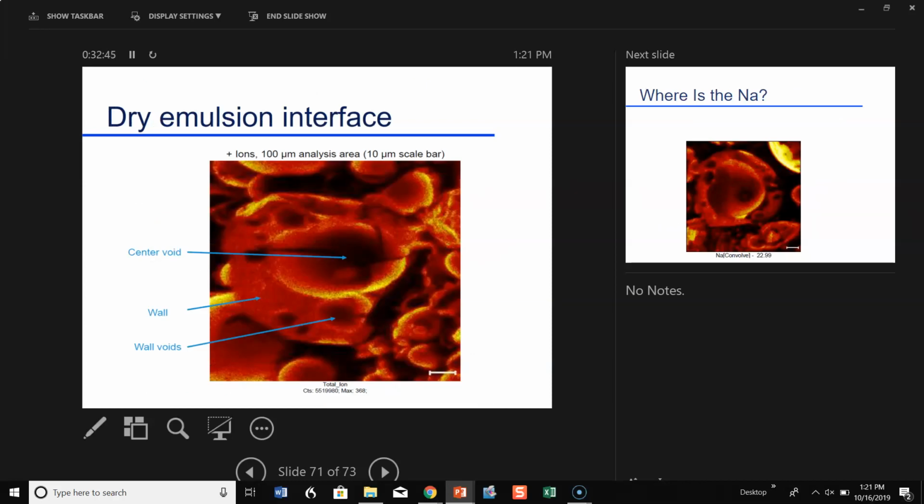This is one that's actually an encapsulated material. This is where orange oil used to be. And so it's a powder particle. Powder particles drop 30 microns, in case you won't see that. So it's a small particle. And we start scanning with a mass spectrometer. We see, okay, here's kind of what this oil is encapsulated in. It's a starch, it's a protein. And then this is where the orange oil is. And we can get a composition of orange oil.